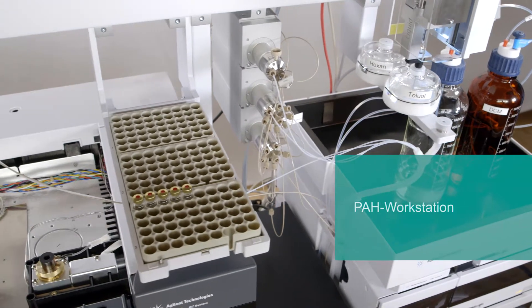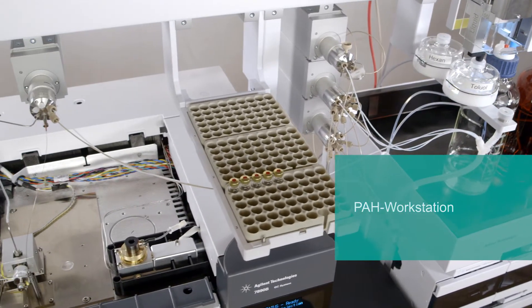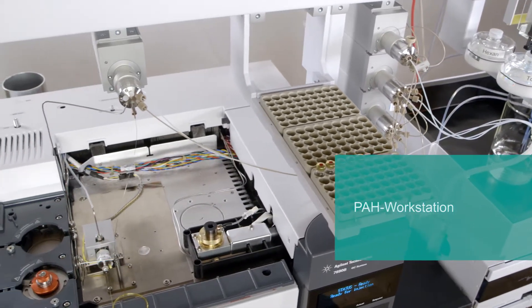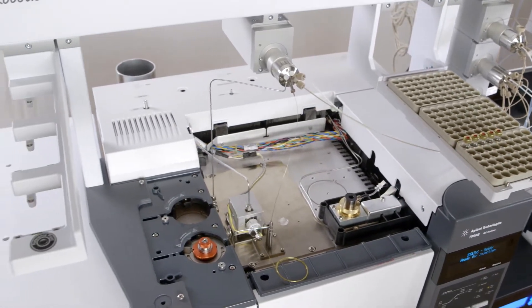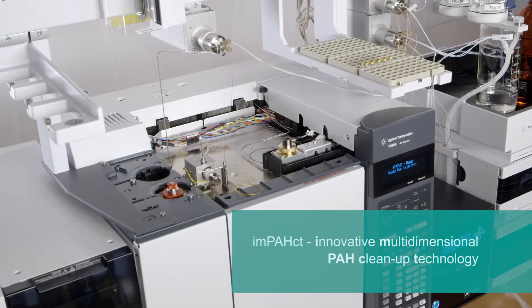Their analysis, however, is still very work-intensive. With the new PAH analyzer, the PAH analysis has now been automated and simplified using the LC-LC-GC-MS system.